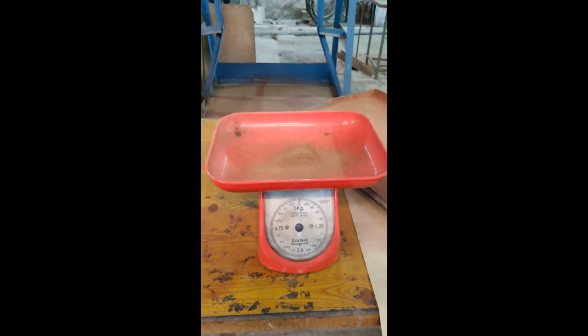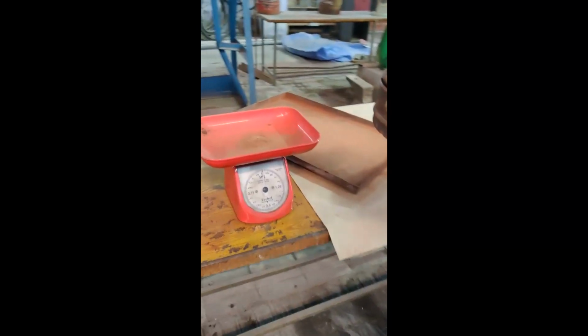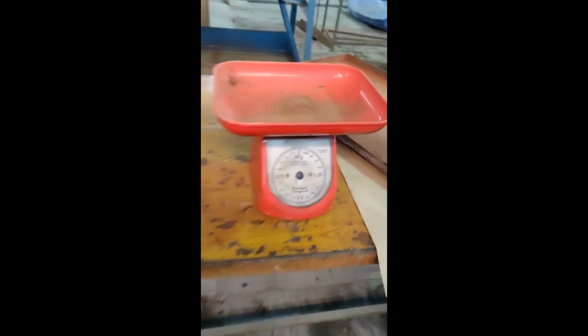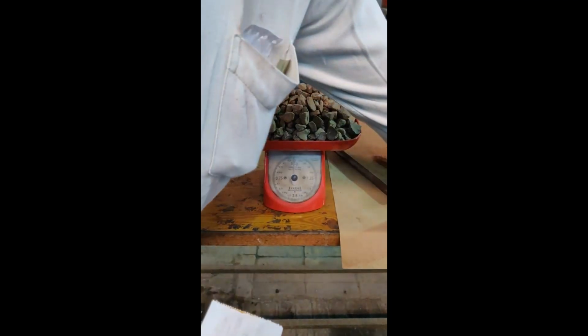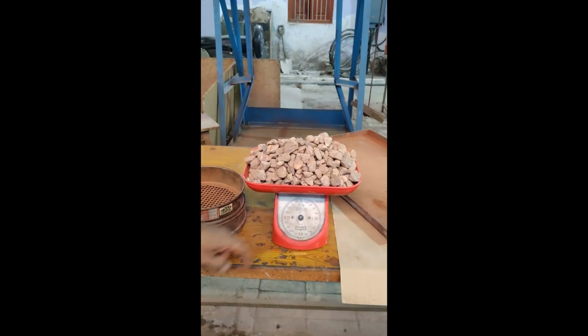This is the minus 0.5 fraction weight, that is showing 25 grams. And this is the plus 6.3 fraction weight, which is coming to 4.87.